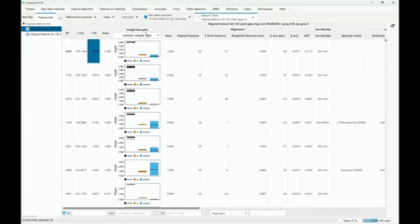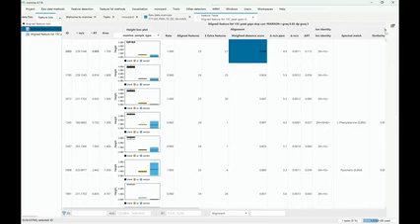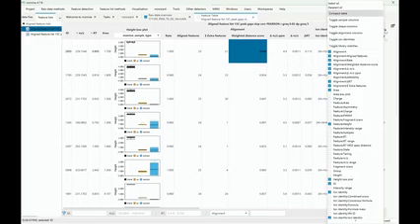There are now box plots. There is some statistics on alignment, and I guess you don't see that because I already changed my table. You can personalize your table if you just click on this plus button, and I hope most of you are actually done with the processing. Okay, yeah, it was just going fast. My laptop is quite good, so I thought it could take a bit longer, but usually it's quite fast to process these files.